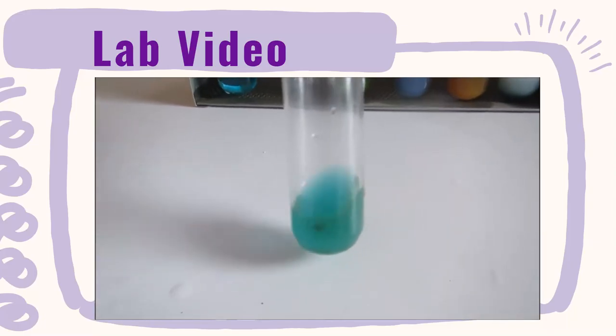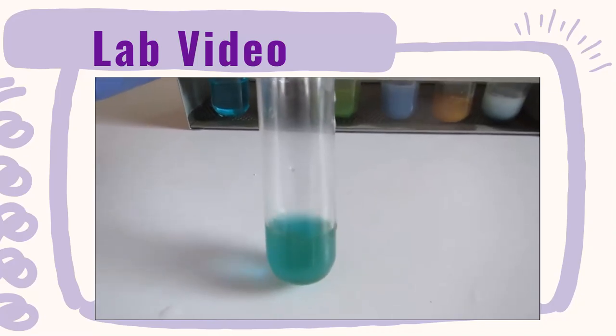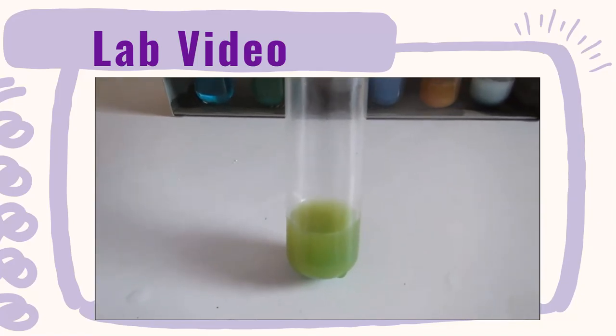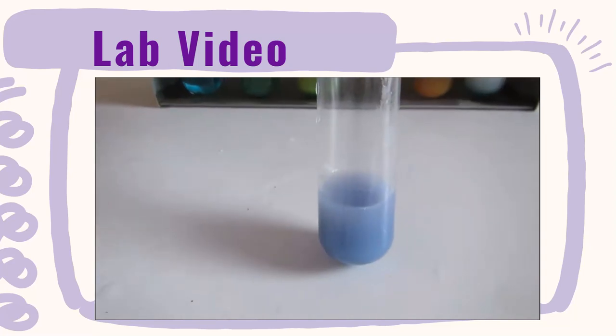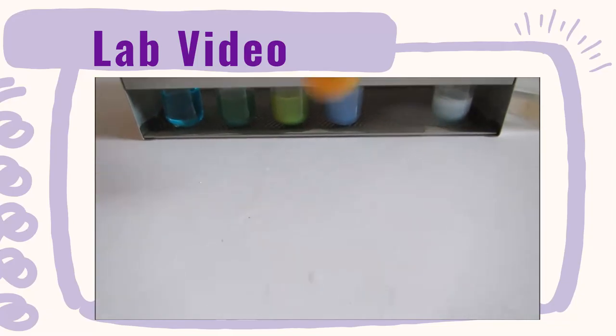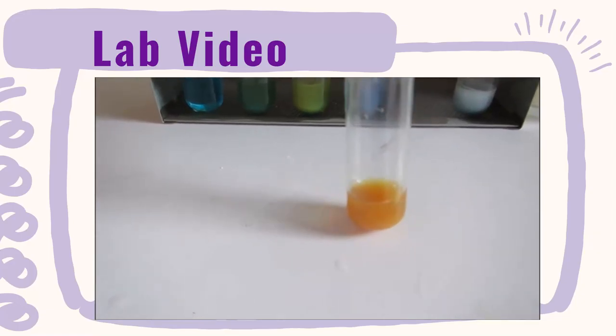Okay, so now the sugars test has taken place in the water. I can show you the results. The negative control, our deionized water, has remained the blue of the Benedict's solution. The next one is our positive control, so it's gone a yellow-orange in color. The more sugar there is, the brighter the yellow or the orange will be.